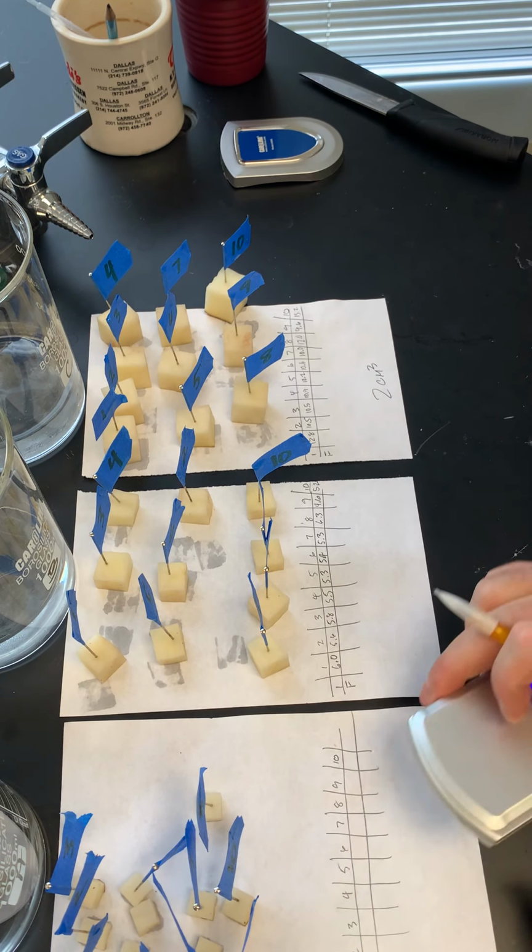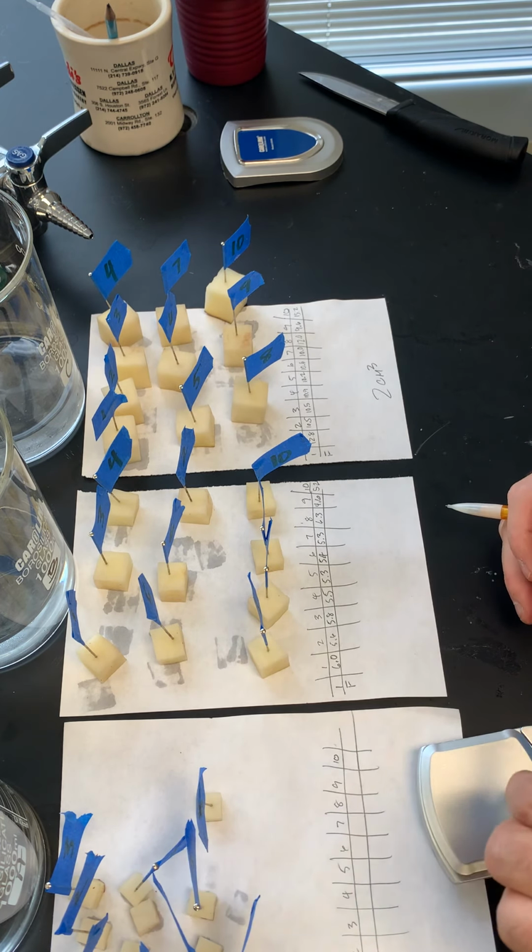Okay, now we're going to do this last group, this one that are 1 cubic centimeters.